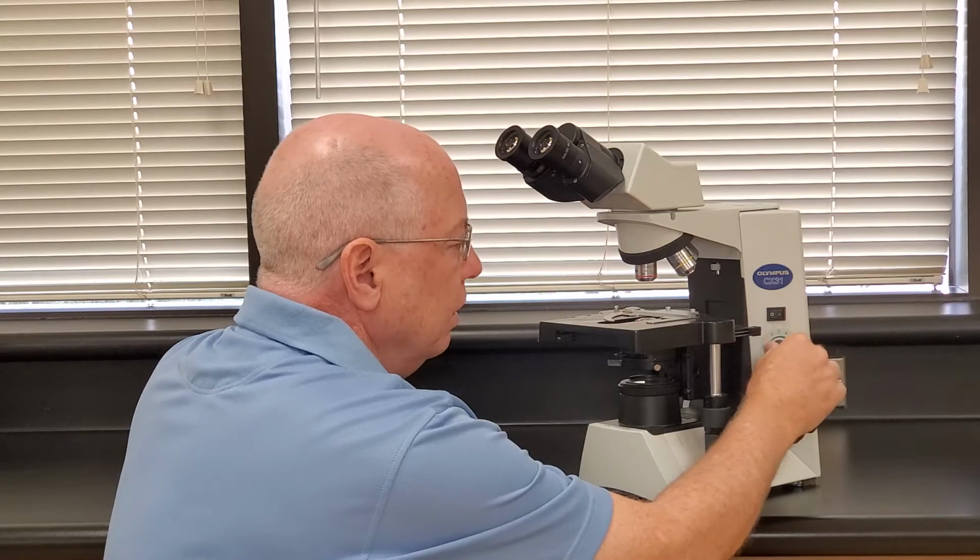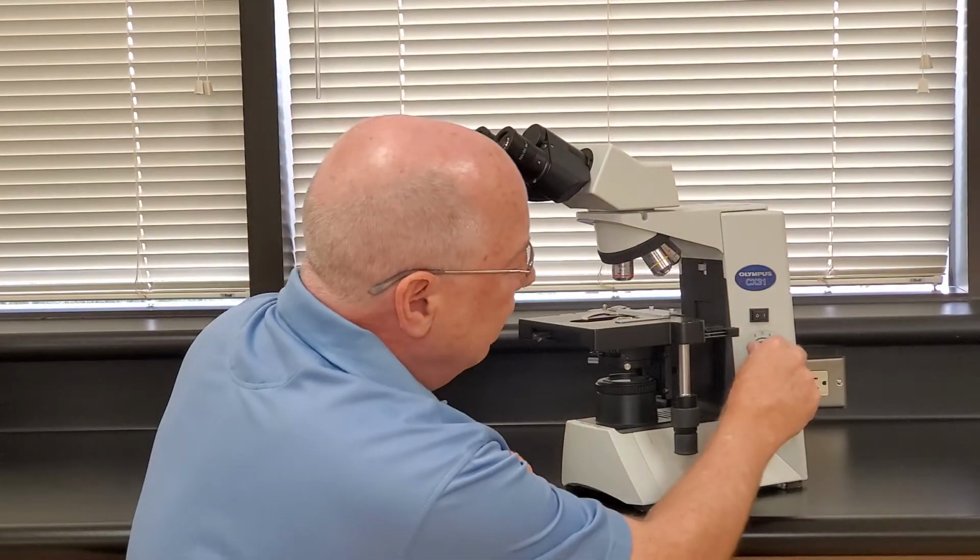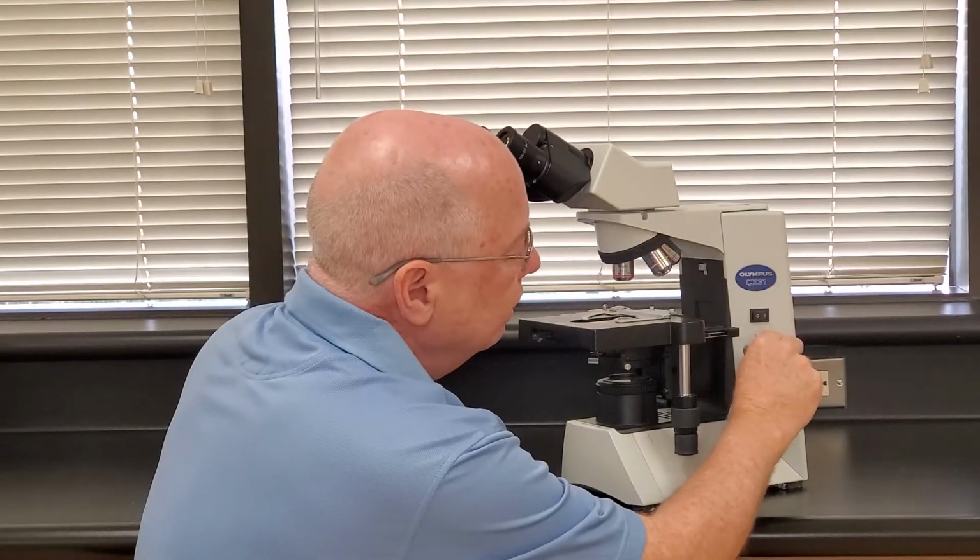So, the first thing you do when you get a microscope is you're going to plug it in. You're going to use the power switch, the on-off switch, to turn it on. And then there's a light control knob or a light intensity control knob. It's essentially a dimmer switch like you have on a light at home. And you want to turn the light up some.